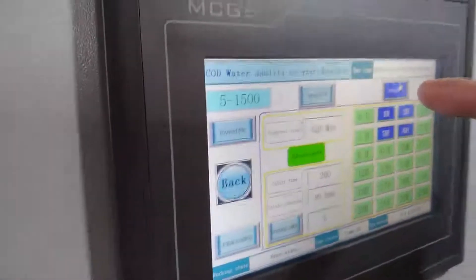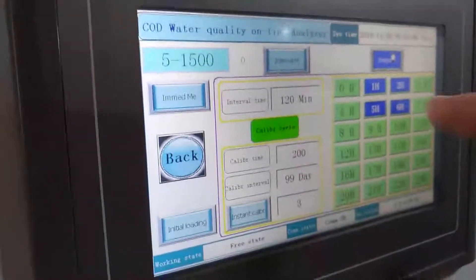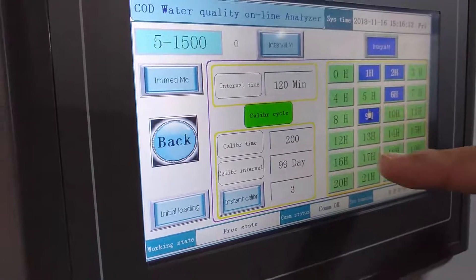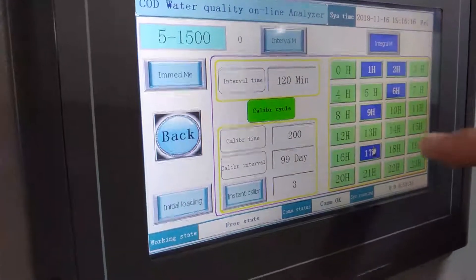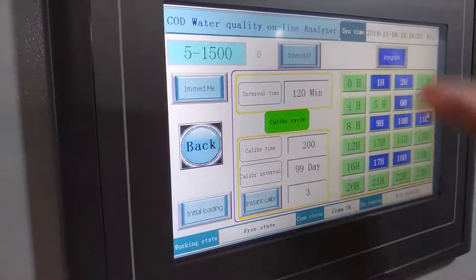This measurement type is integral measurement. You can choose the integral time that you want to measure, just based on your requirement.